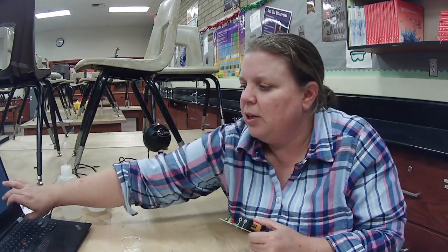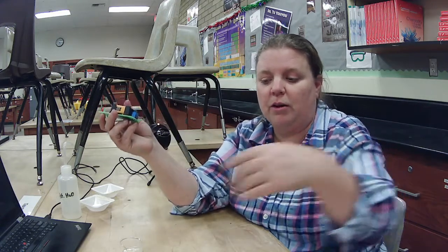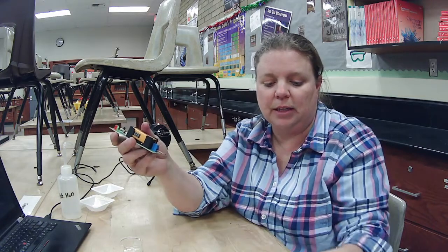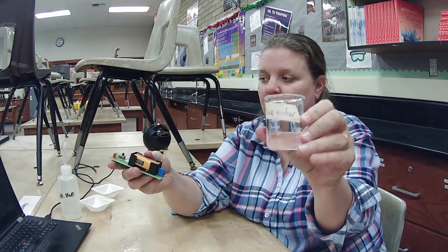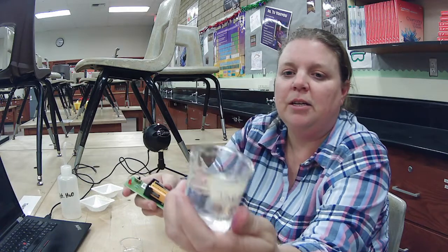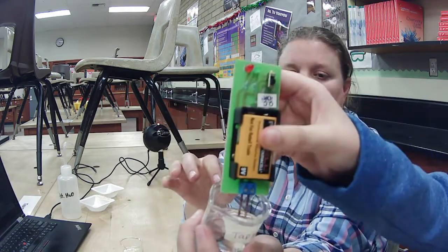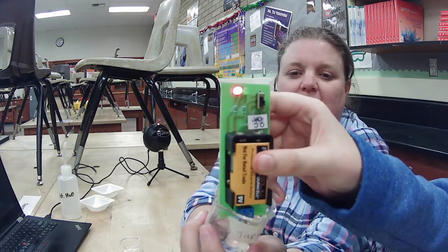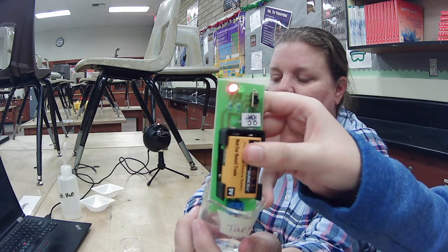I'm just going to look at my list, to make sure I go in the right order. The first thing we're going to do is tap water. Tap water is not pure water, of course. It does have ions in it. It has different salts and so forth in it. I'm going to tip it, and Josie, you're just going to put that into the water to see what happens. Now notice that has a very bright light. So tap water actually has a very high conductivity.